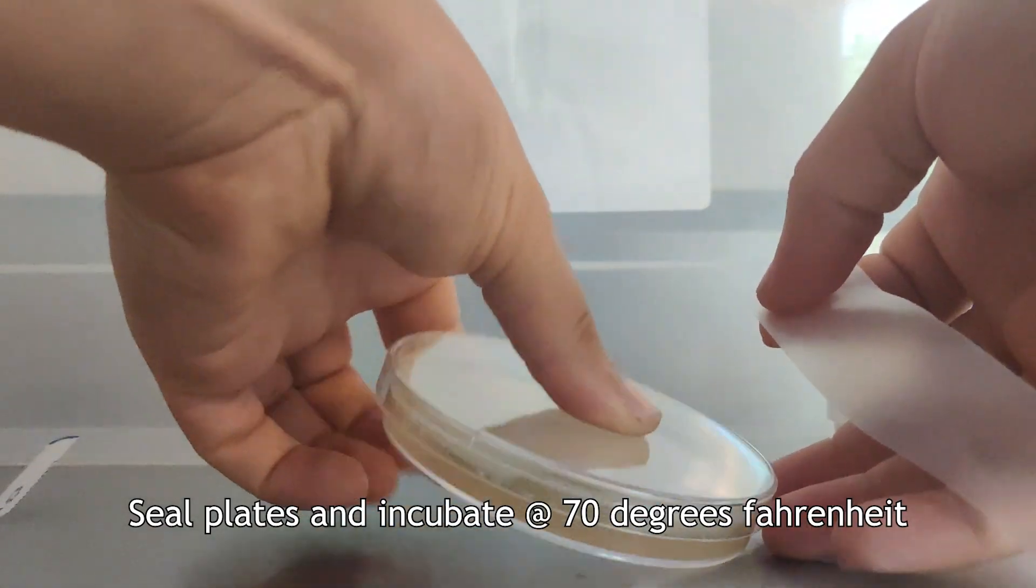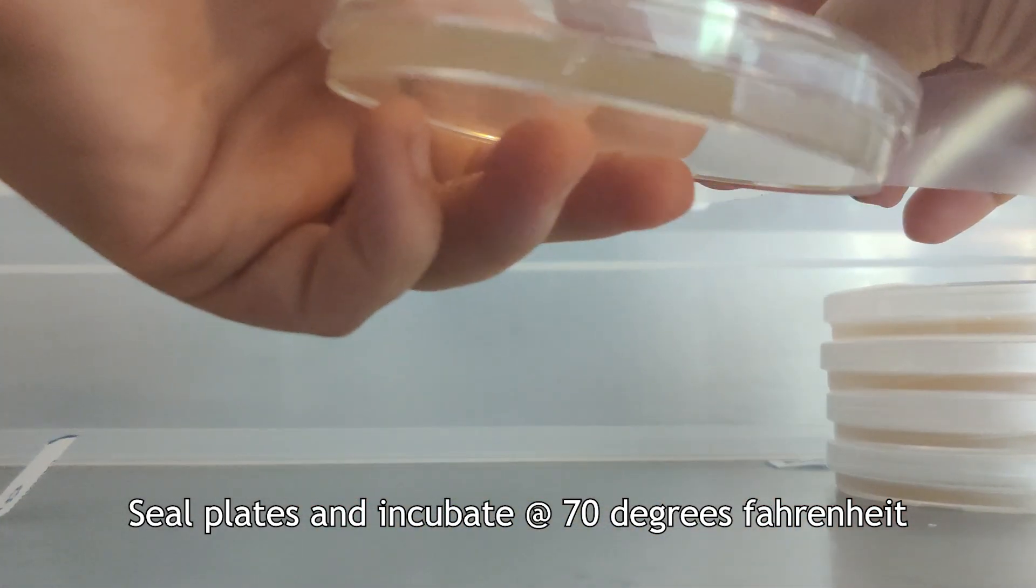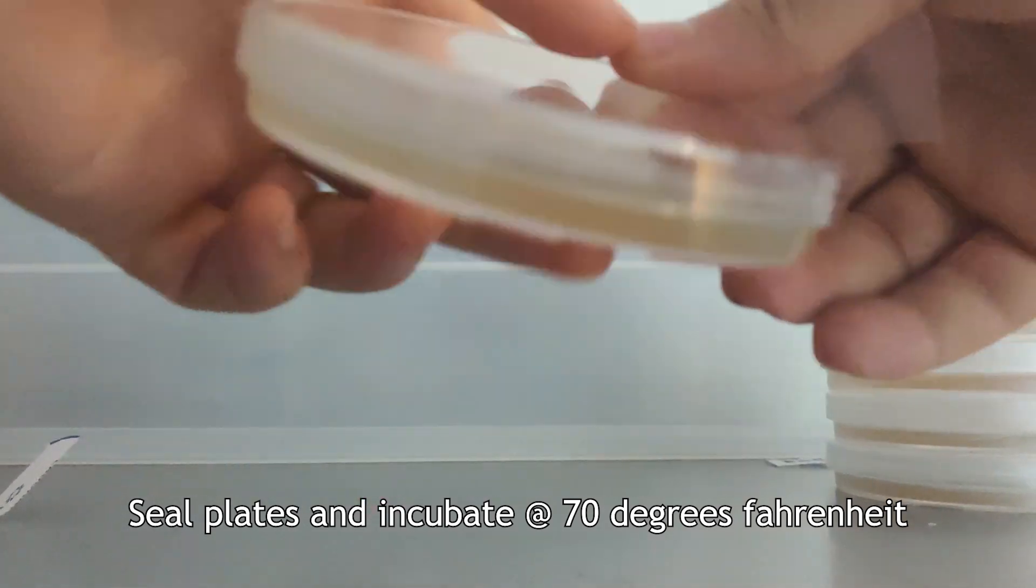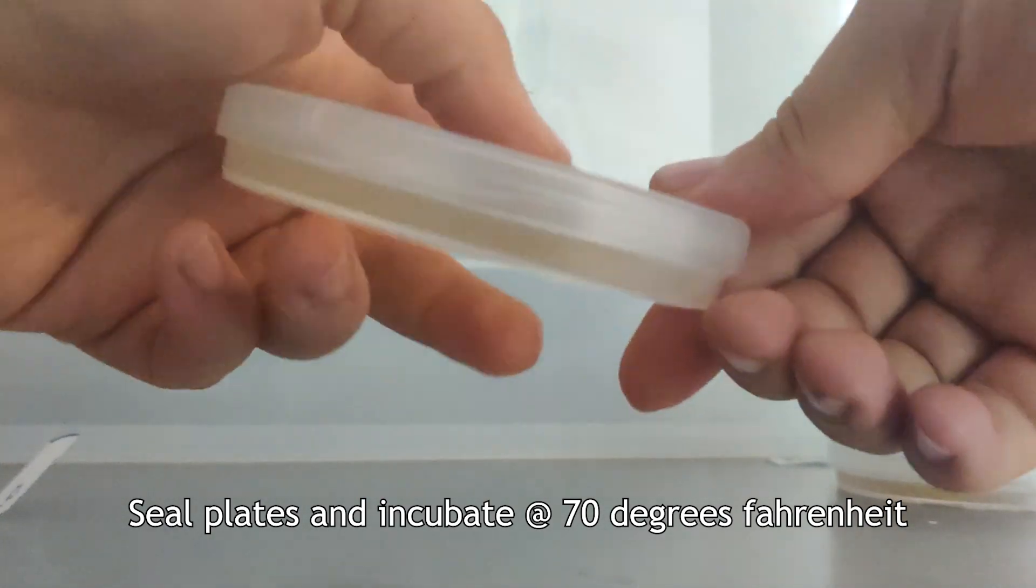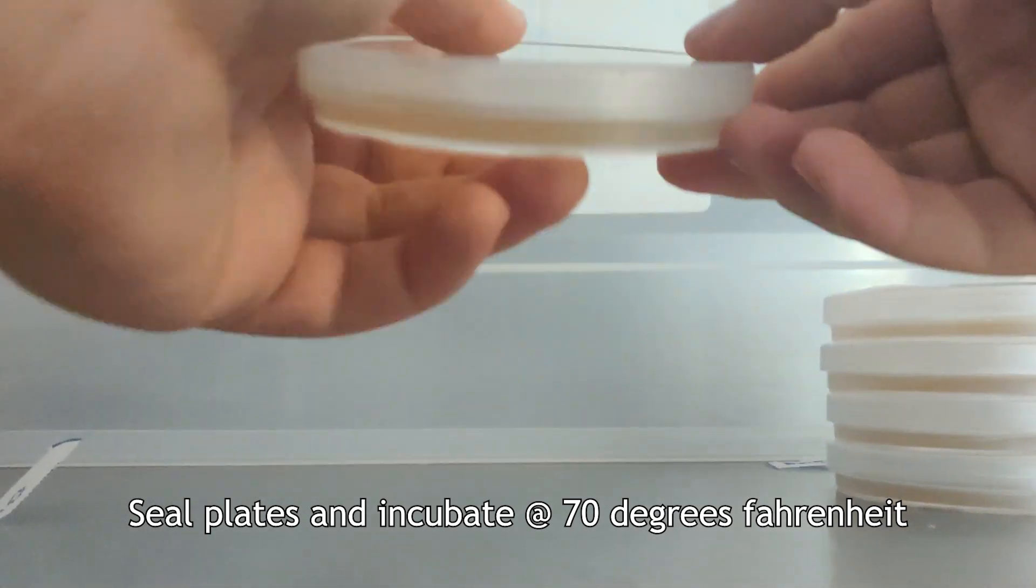Place the plates in a dark, low traffic area at about 70 degrees Fahrenheit. The ideal germination temperature varies depending on the variety of mushroom you are growing, but 70 degrees is typically a good starting point for most varieties.